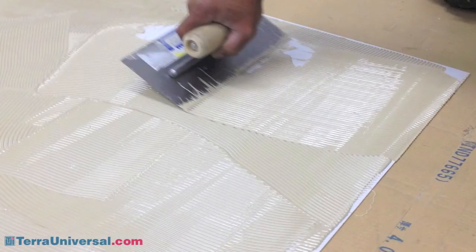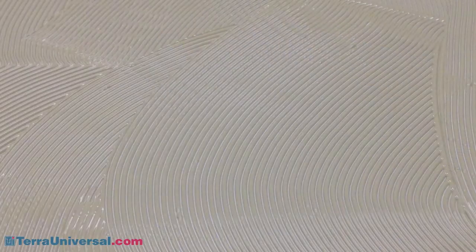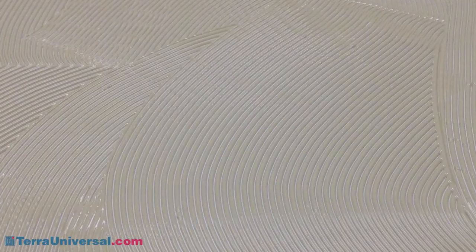Our team is ready to apply their pre-cut panels. Polymer adhesive was already applied with a V-notched trowel. For best results, cover the entire backside of the panel in a multi-directional pattern.